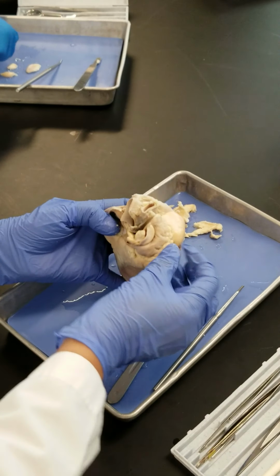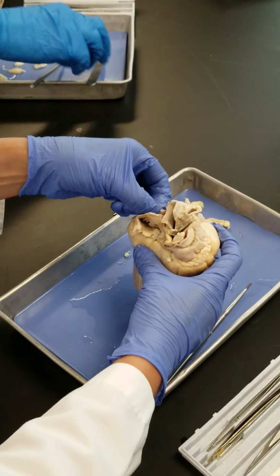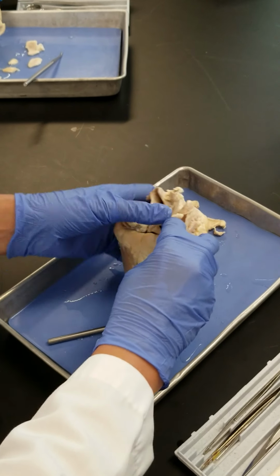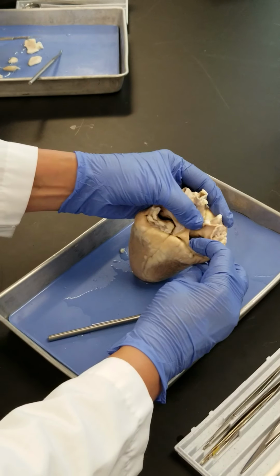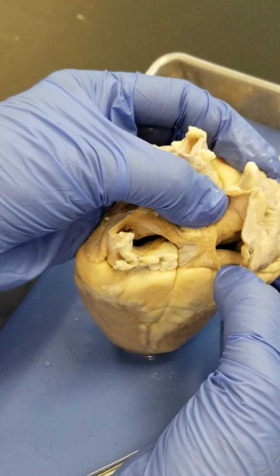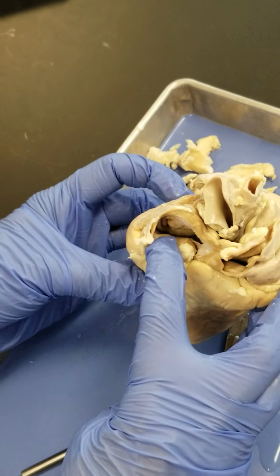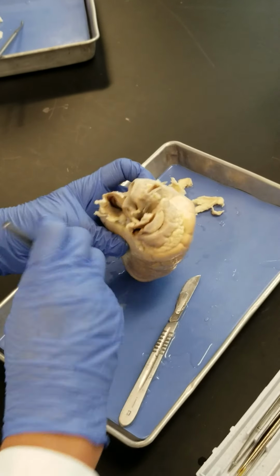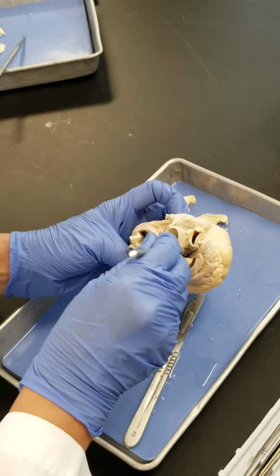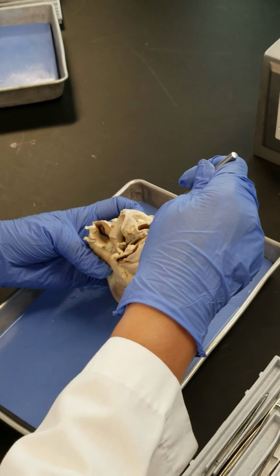So here, you saw the auricle. This is the auricle of the right atrium, auricle of the left atrium. Then if I open it, you see the cavity of the right atrium here. Cavity of the right atrium, and this one, the cavity of the left atrium, right? Now, we said that we had the pulmonary trunk here. Then we had the aorta, aortic arch, and this first branch, the brachiocephalic trunk here.